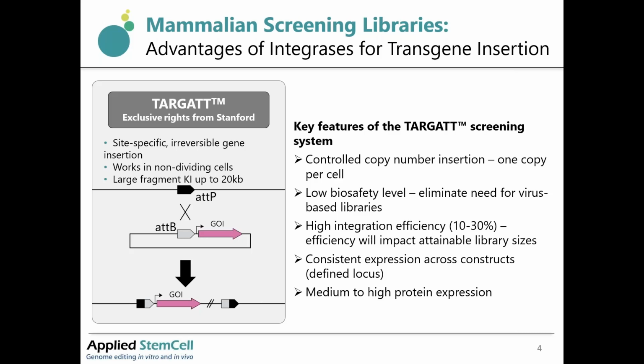The integration system shown here is site-specific, irreversible, and works in non-dividing cells. The knockin size for genes can be large, up to 20 kb.